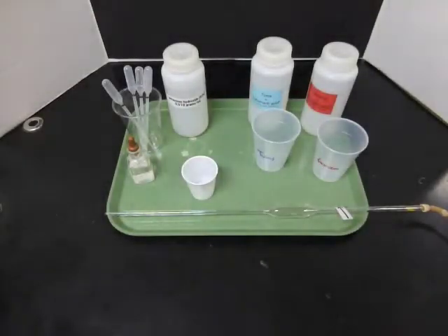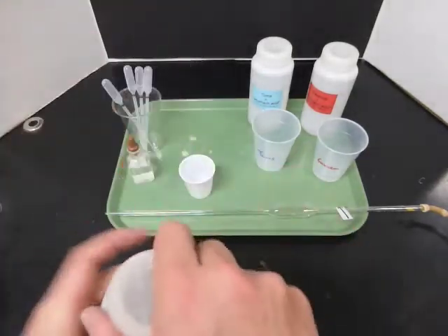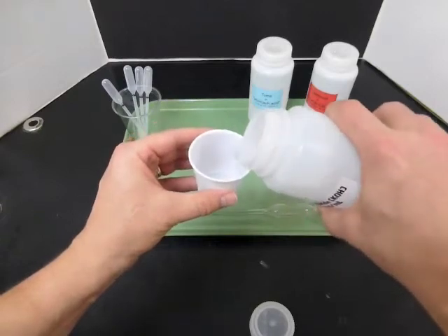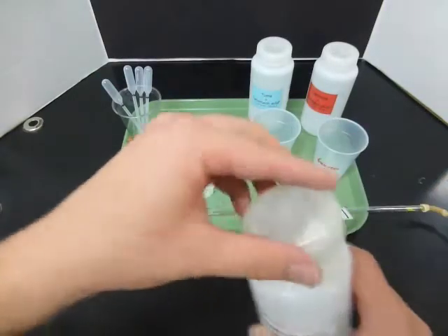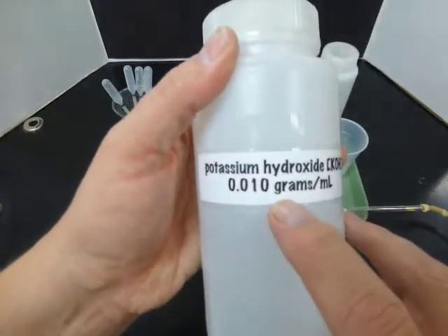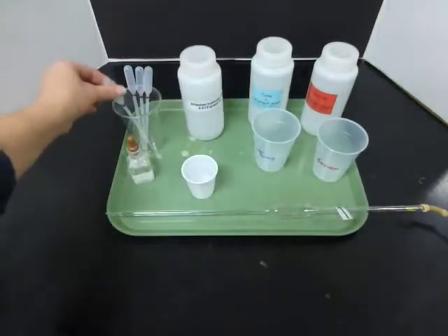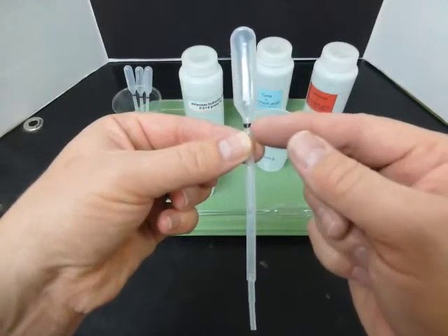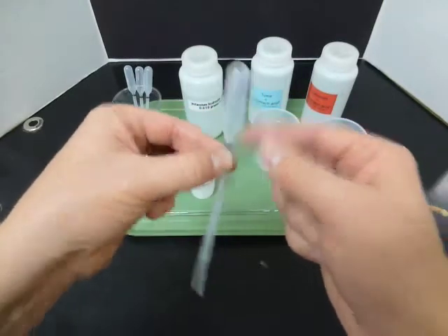So when you look at the procedures, the first thing that you'll need is a small white cup, and we'll fill that halfway with our solution of potassium hydroxide. This is the stuff that we're going to add to the acid to see how much acid there is. The potassium hydroxide solution, each milliliter has 0.010 grams. And we're going to add it 1 milliliter at a time using the little squeezy pipette. Draw the liquid right up to the black line for each 1 milliliter that you want to measure.